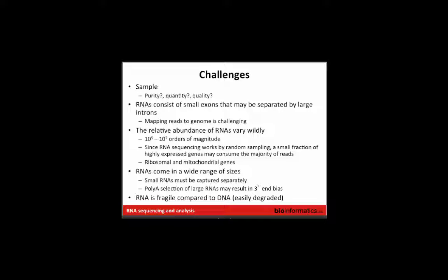Is that also your assumption, that when you compare disease versus control or tumor versus normal tissue, the amount of expression is proportional to the amount that you detected? Yeah, that's why it's by random sampling. You do assume that, and I think you're edging towards an area of analysis called data normalization, which deals with potential biases between your two samples that aren't related to the biology that you're studying and that you want to correct so that when you do compare them, you can see differences that are related to biology. We're going to talk a little bit about that, but it's also in itself a big topic.